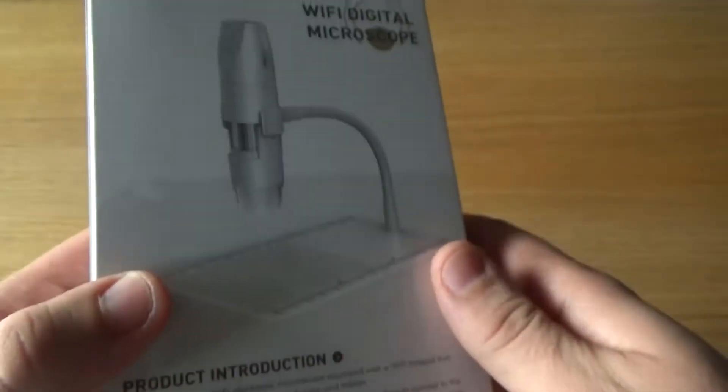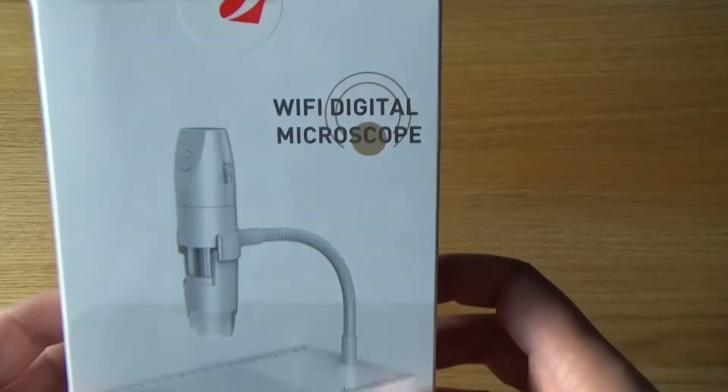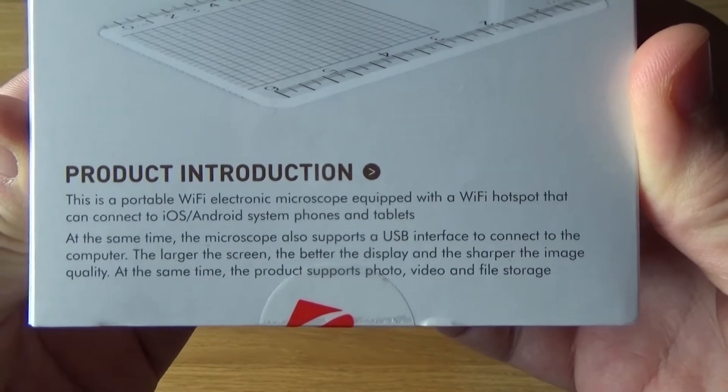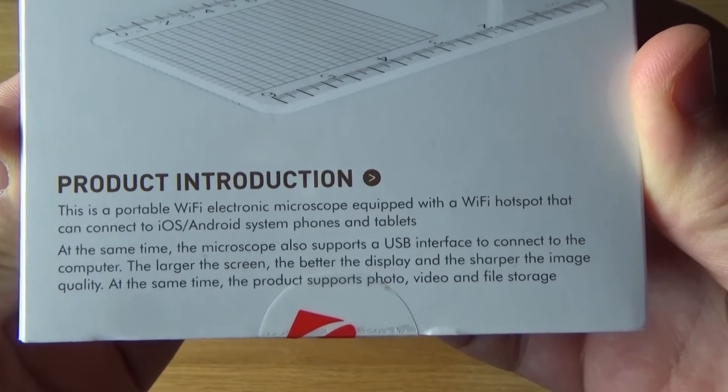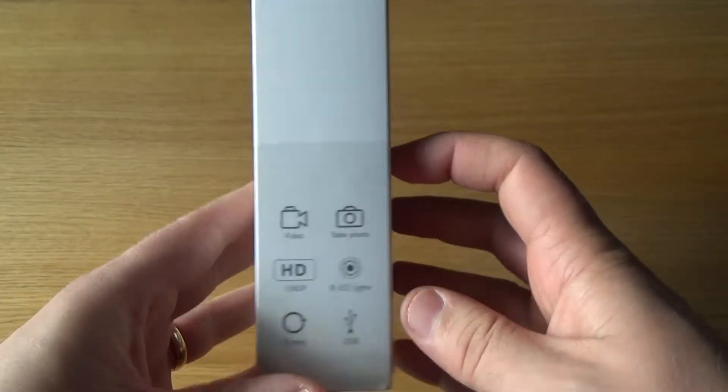Here are some tech specifications — if you want to read those at your own leisure, you can pause the video and do that. That important point on the front: it's a Wi-Fi microscope, and that is an actual cool feature. I'm going to talk about that at the very end of the video and show you guys how that works.